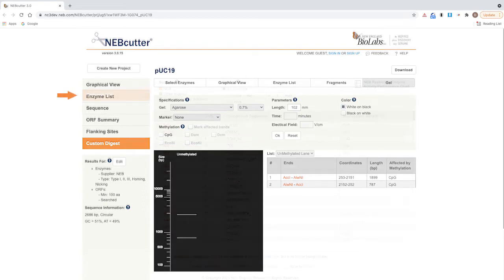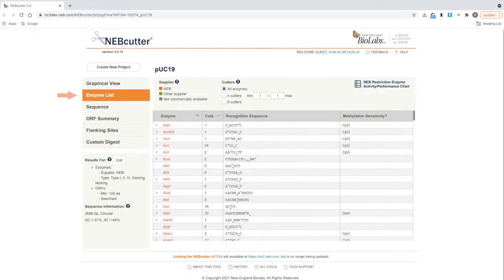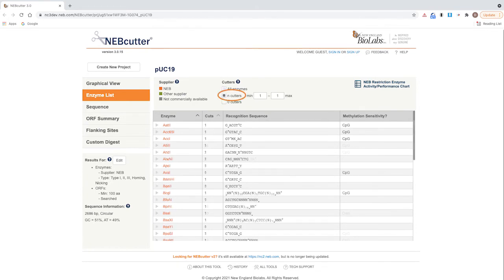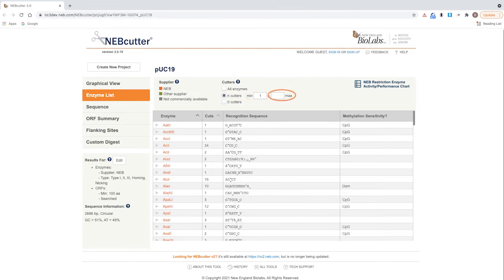The enzyme list view also shows a full list of restriction enzyme sites in the sequence by selecting N cutters and setting Min to 1. You can leave max blank.